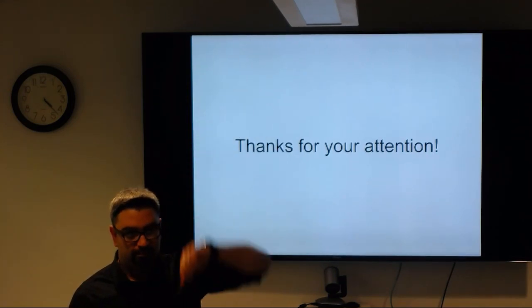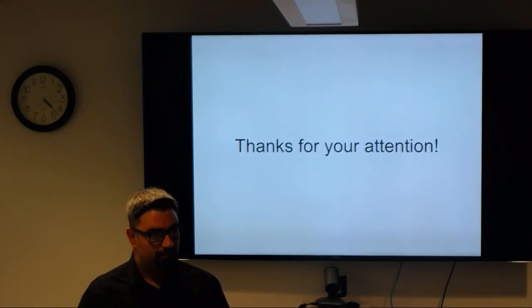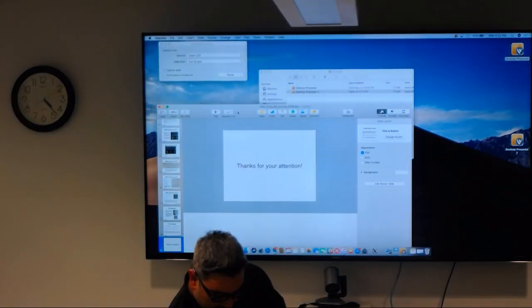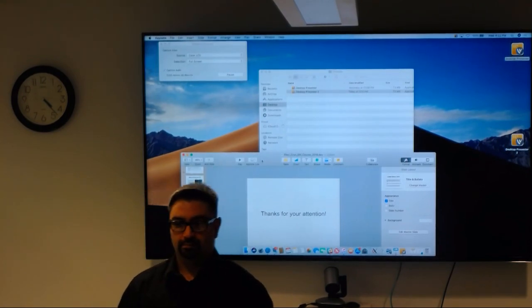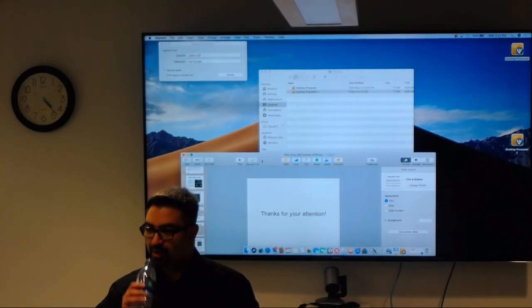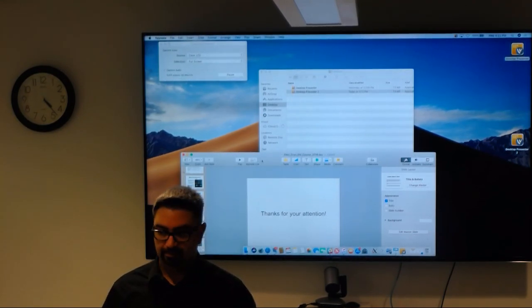That is going to be our microscopy practical, where we'll go over microscope alignment, mostly the gun and the condenser systems. Next week, Monday, is going to be tomography with Wei Dai from Rutgers, so that should be pretty interesting for a lot of you. And then the Wednesday after that is going to be the practical. For the practical, we'll meet in here, and then we're going to go to the T12, right over here.